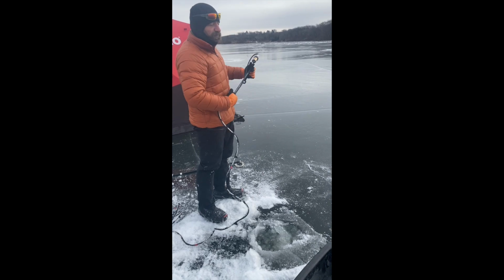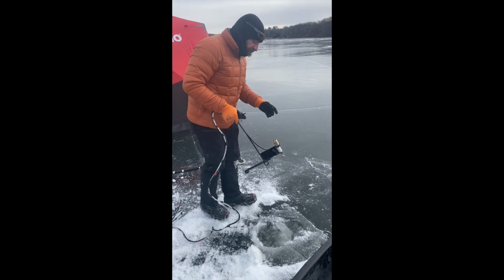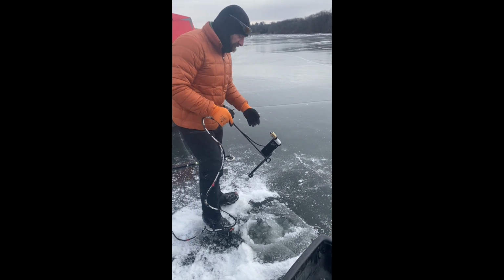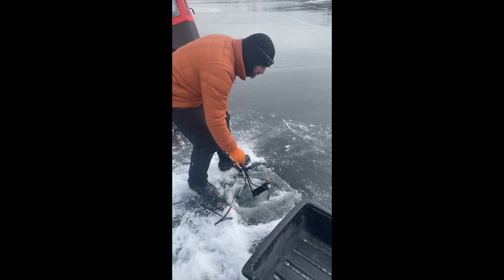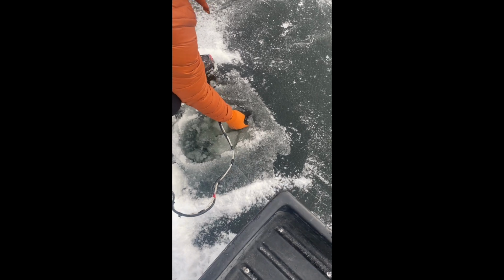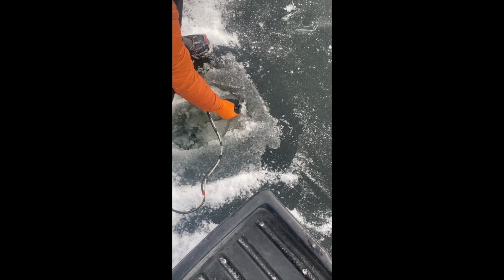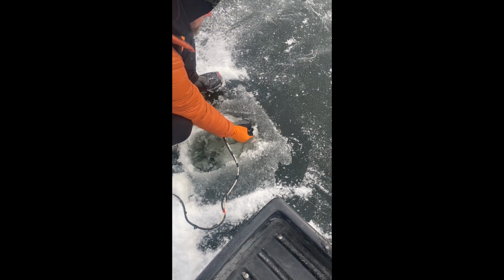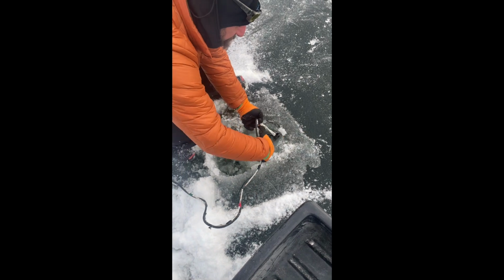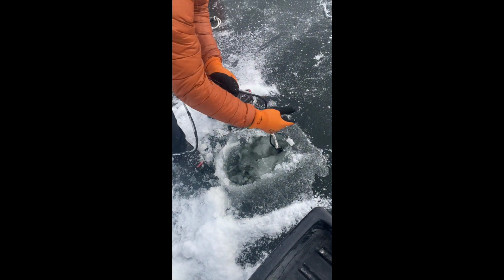Great. So if this was a normal time of year, there would be snow on the ice, and we would do our first profile with snow-covered ice. Because there is no snow, we're going to do it like this. So our first measurement underwater is going to be right under the surface of the ice. So we're going to insert this under the ice and press the sensor to the very bottom of the ice, collecting an under ice measurement. 99.22.